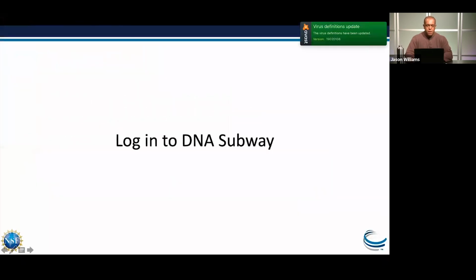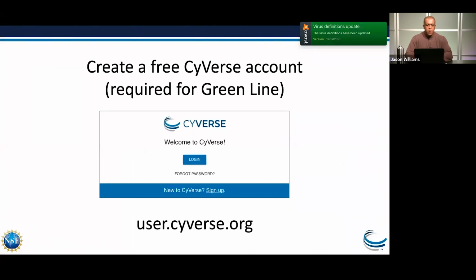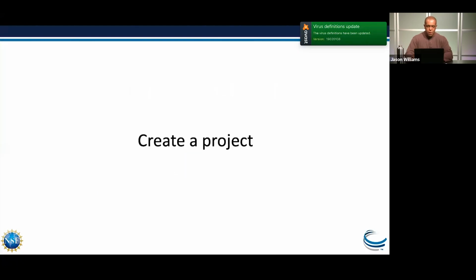But you're going to log into DNA Subway, and one thing that you do need to do is make sure that you have a CyVerse account. So you can get a free CyVerse account. It's always free, but it is something that we encourage everyone to do, and that's available at user.CyVerse.org.